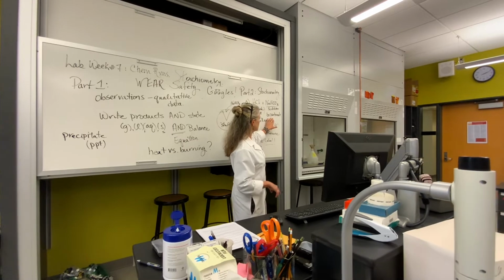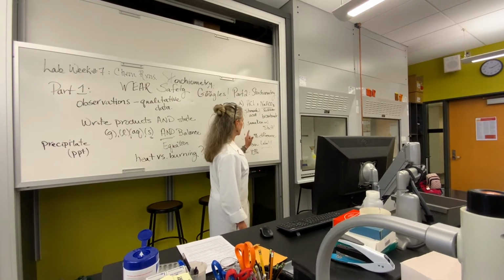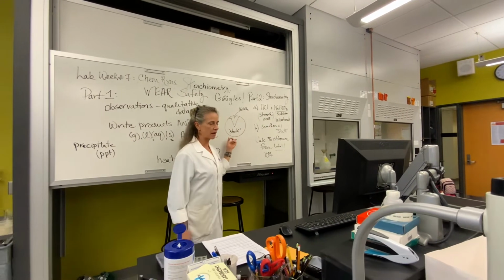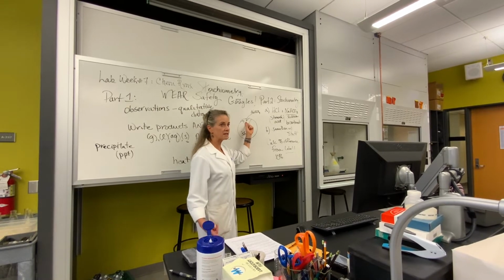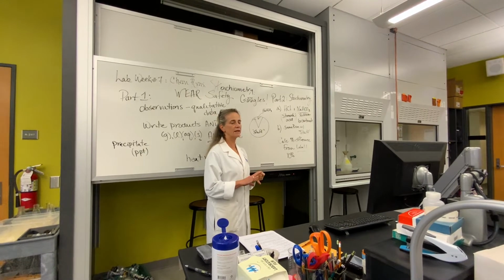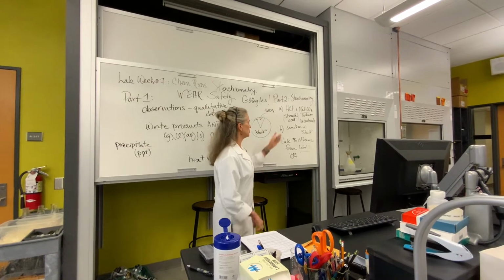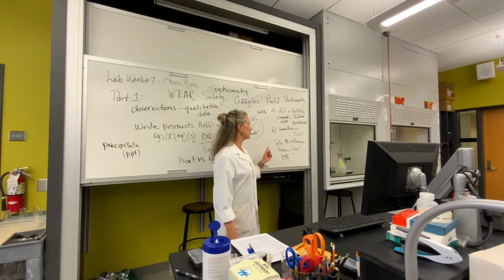The first time we're going to do it, and then the second time we're going to do it again. It's the same reactant, it's still sodium bicarbonate, but it's in a tablet, okay? In that tablet, only part of the tablet is the sodium bicarbonate, and the rest of it is other stuff. It's citric acid to make it taste good, it's aspirin to make you feel better, it's other stuff. So when you do the first one, typically it's going to be very clean looking and very clear. And then the second one, it won't be.